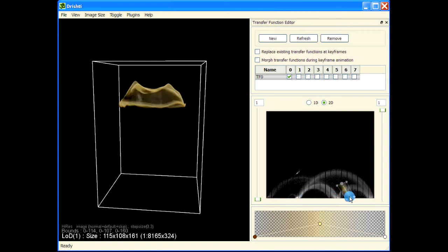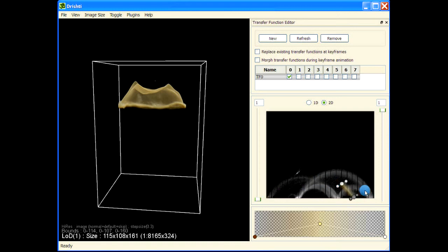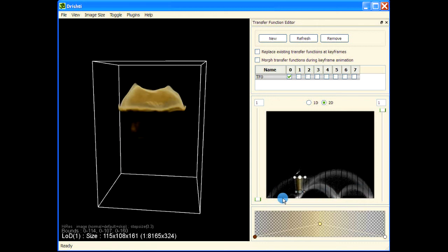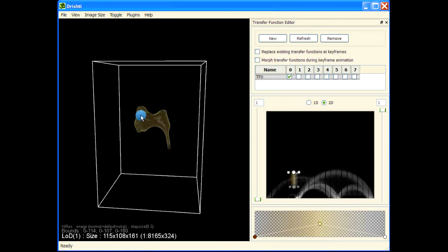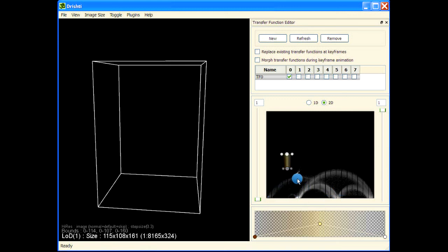We can also move that. I'm catching this boundary here — we can catch another boundary here and that's the root of the teeth. That's the boundary between the root phase and this phase here, because this arch is going from here into this phase. So we have four arches: first, second, third, and fourth, and these arches give us the boundaries between the phases and their relationships in the data.